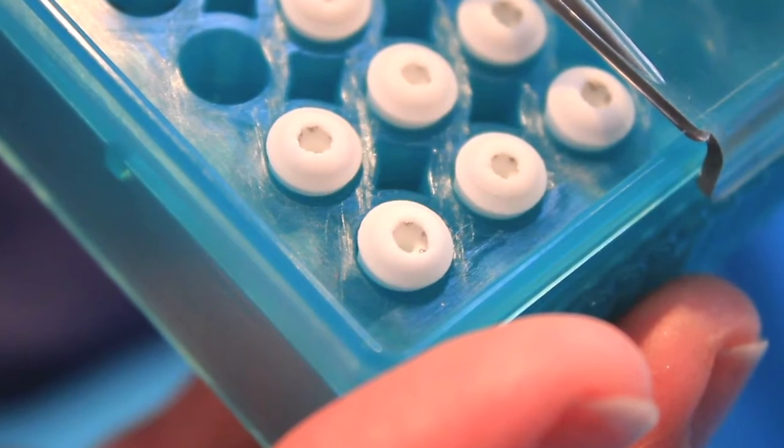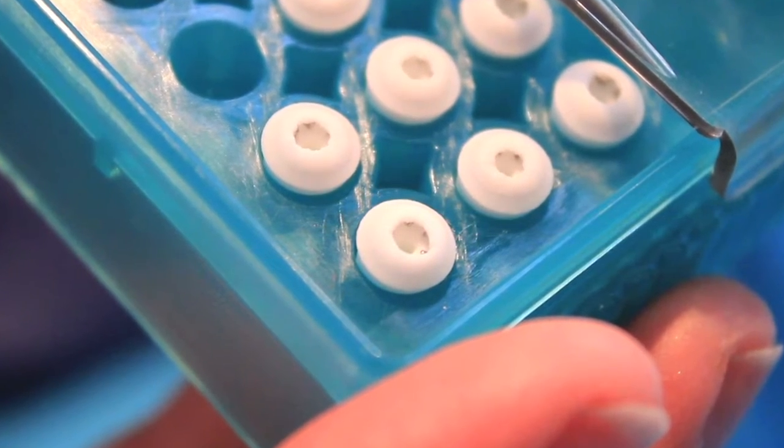As mentioned earlier, FlowMe is designed for small volume samples — 1000 microliters or less — and your sample should have no more than 2 million cells per 1000 microliters. Attaching FlowMe to the end of your pipette tip does not require a lot of pressure, about the same as you use to attach the pipette tip itself.